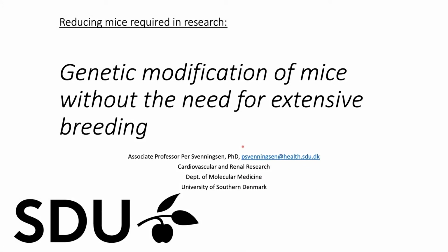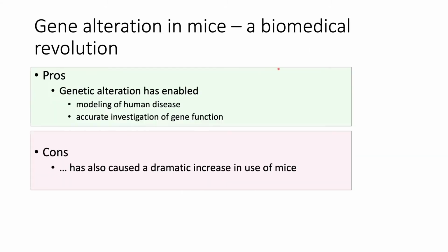The title of this presentation is Genetic Modification of Mice Without the Need for Extensive Breeding. And the aim of this project is to reduce the number of mice required to perform research with genetically altered mice.